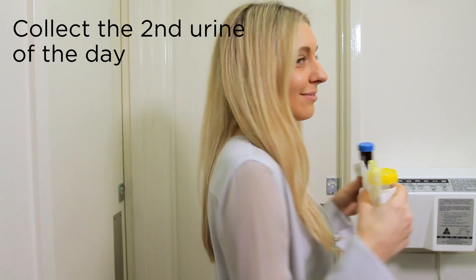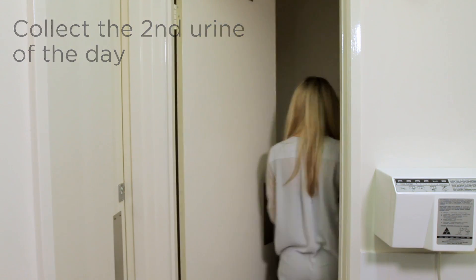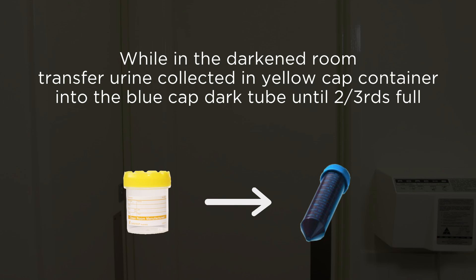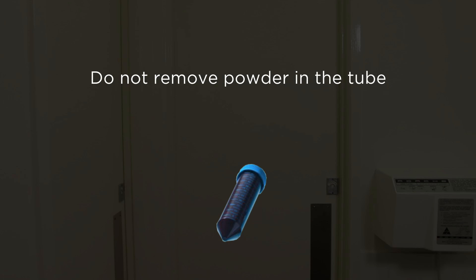Next, collect a urine sample from the second urine of the day into the 50 milliliter yellow screw cap jar. Immediately pour some urine into the 50 milliliter dark screw cap tube until it is two-thirds full. Do not remove or discard the powder. The powder is an ascorbate and is used to preserve and stabilize the quality of the urine which is contained in the 50 milliliter dark blue screw cap tube.